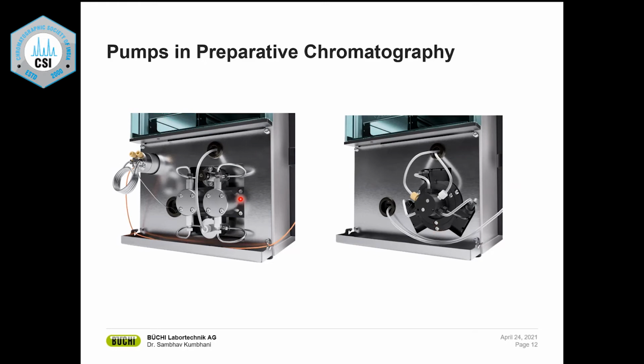These are standard HPLC metal pumps that can resist pressure of 300 bar or more, 200 to 500, 600 bar pressure resistance capacity. The way this pump works is basically each one of these has a piston in it, and these pistons work in parallel. One piston is pulling the solvent from the reservoir bottle, while the other piston is pushing the solvent into your column or cartridge.